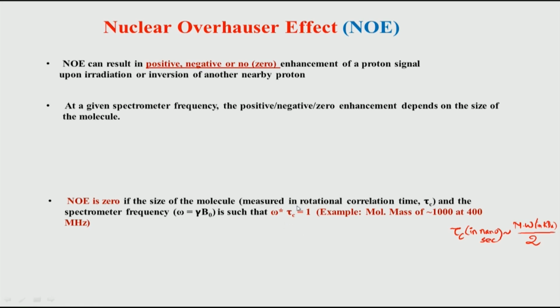So, if you go to lower temperature, in this case let us say 5 degrees, remember the formula which I have shown here is typically for 20 to 25 degrees Celsius. But let us say I go to a very low temperature of 5 degrees, the molecule is still not static, the sample is not frozen, and let us say we are looking at a water sample.